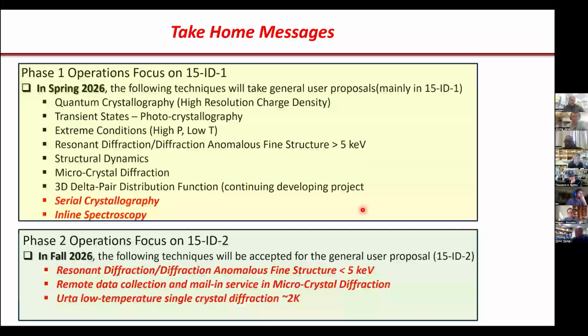We are still working on it. We can construct the reciprocal space right now. We are struggling with how to determine the real Bragg peak and subtract it.